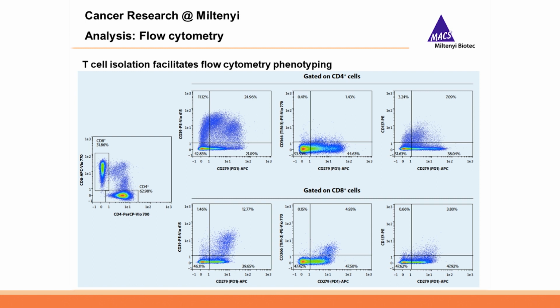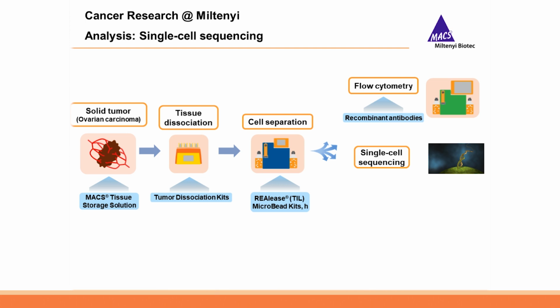In this example, we interrogated the expression of PD-1, CD39, TIM3, and 4-1BB among CD4 T cells on the top row and among CD8 T cells on the bottom row.